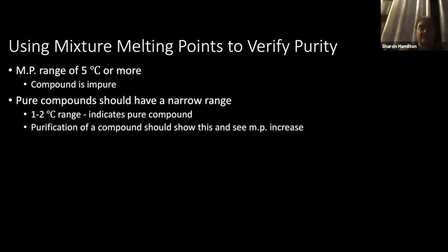While we're not doing that in this lab, we will be able to use this technique of purification and reanalyzing melting points to verify that we have purified a sample in later labs. Likewise, once a compound's been purified, not only should the range of the melting point be smaller, but the melting point itself should increase, because you've gotten rid of those impurities that are causing the melting point depression.